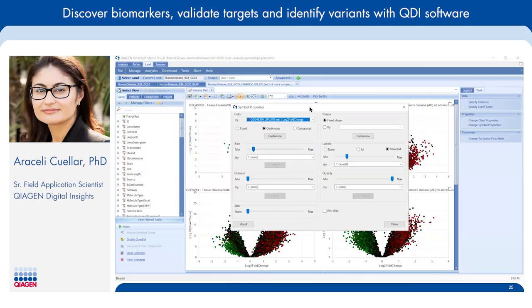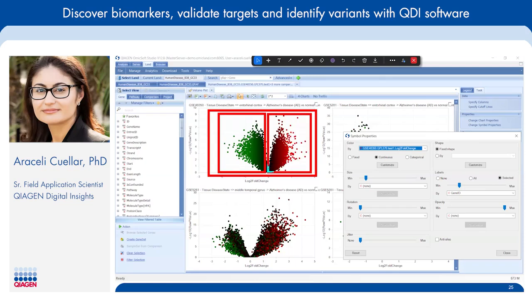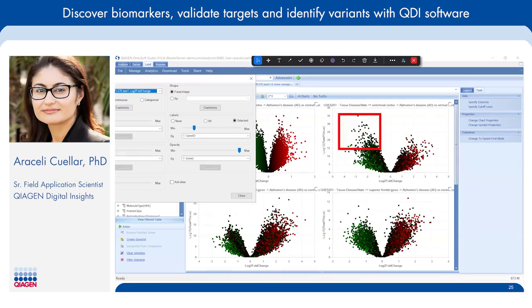And so here you can see that this is your anchor graph, where the green represents downregulation and the red represents upregulation. And you can see that if you compare that with the coloring of the other graphs, some of the expression is very similar, where the genes that are downregulated in our anchor plot are also downregulated here, right, and here, right?